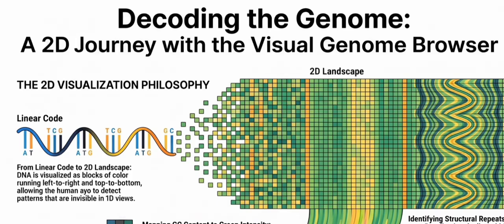Now, I have to stop and push back on this design choice for a second. Let me make sure I understand the workflow. I've used my predictive search to find my target gene. I've used my display filters to cut out the pseudogenes and the noise. I've loaded my patient's massive VCF file. I'm actively analyzing the data. Okay, I'm with you. If the less than and greater than keys now automatically switch between the mom and dad versions of the gene, how do I go back to jumping between the exons? Do I just completely lose my structural navigation tools the minute I load a patient file?